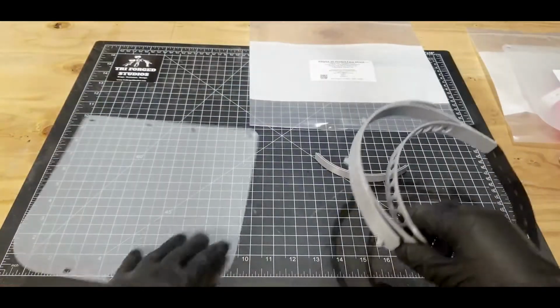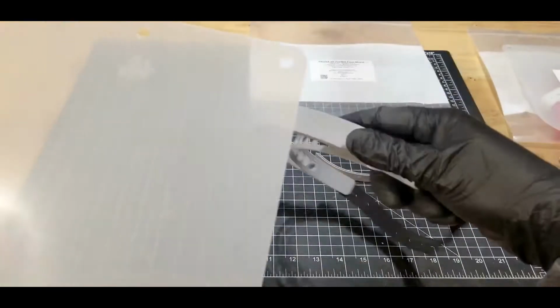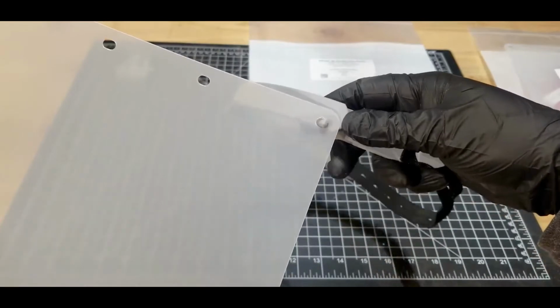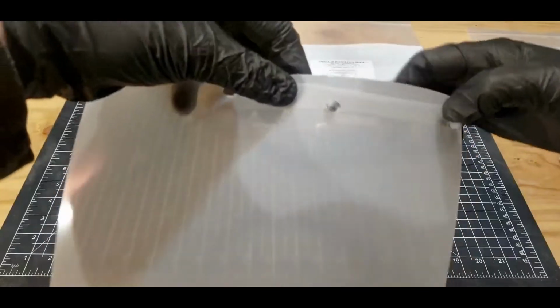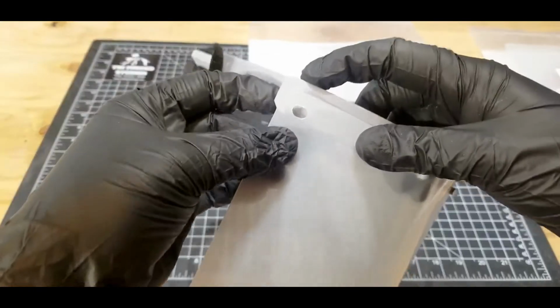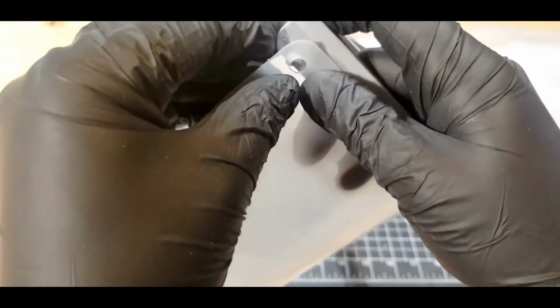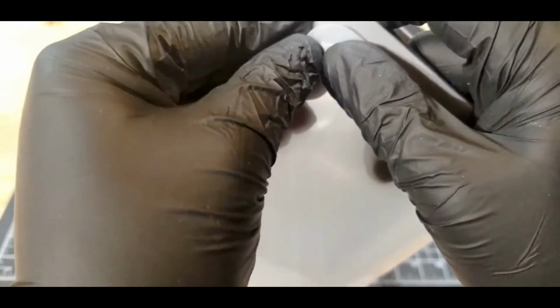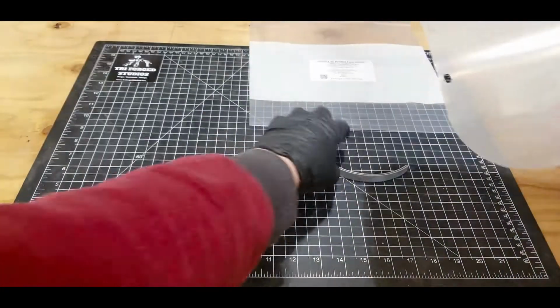And then you want to take your face shield. You'll take this point here. You're going to hook it onto this side here. And this peg will go into this piece here. And then to get this in, I like to slide this a little bit up. That's it. You'll have a nice curve.